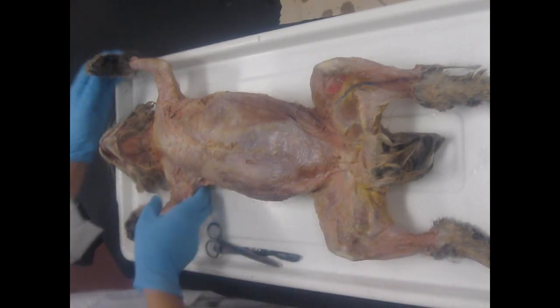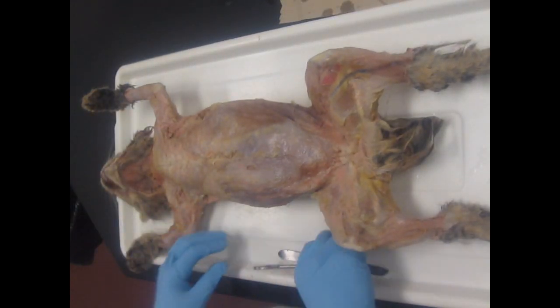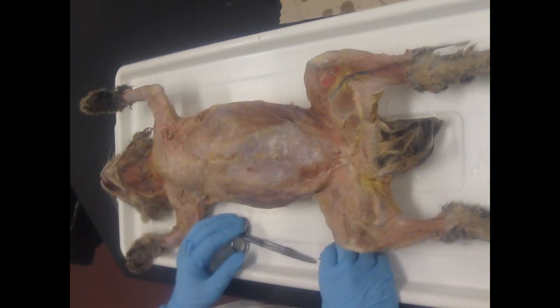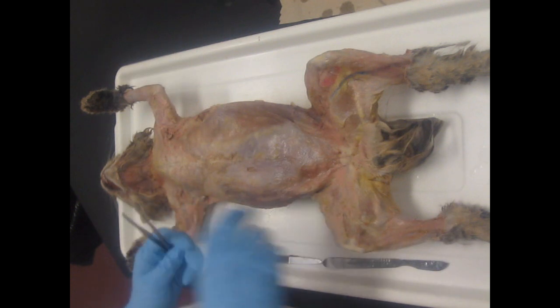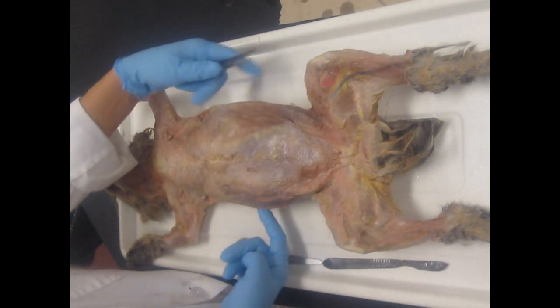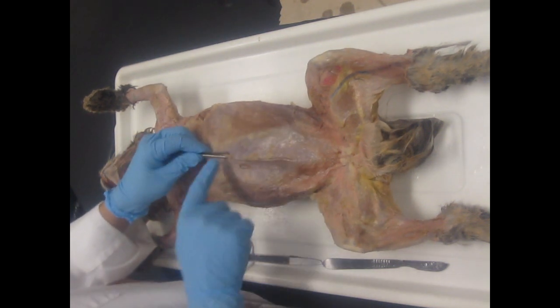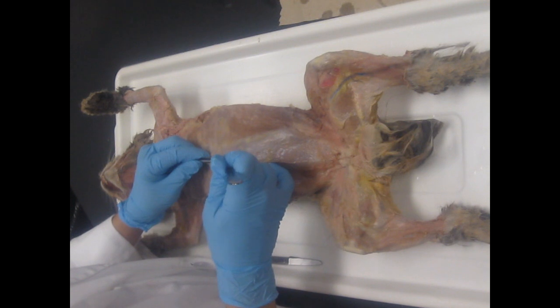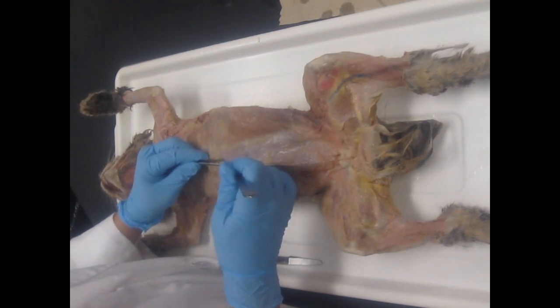Okay, the next segment of dissection is cavities. Today we're going to be opening the thoracic and abdominal pelvic cavities. Now, if the company that prepared the cat made their incision for the abdomen on the sides, then you have to make an incision along the midline of the cat. If that's where your company already made the incision, then you can skip that part.